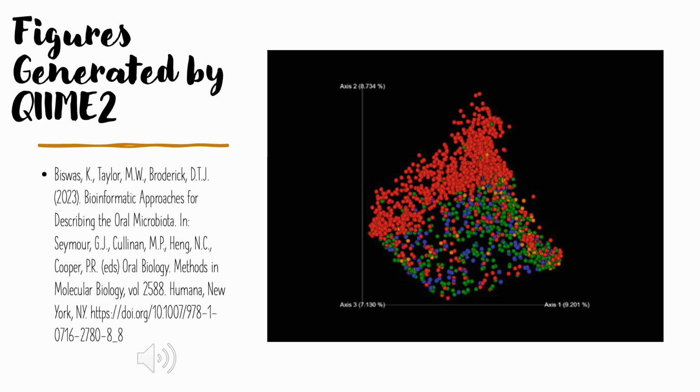And actually, they have a few examples on there. You don't need to have the data. You could also pull it from papers and just copy and paste it over by saving the file to your local computer and then dragging and dropping it into there. And it'll let you look at it. It's really, really cool. It's really hard to explain this interactive data piece without being able to physically see it.